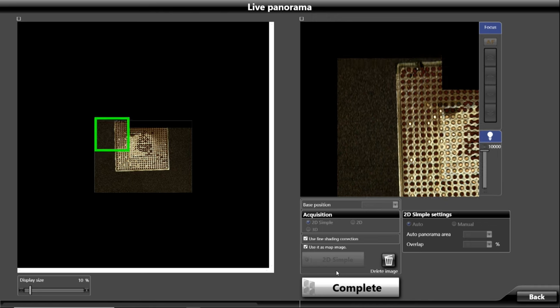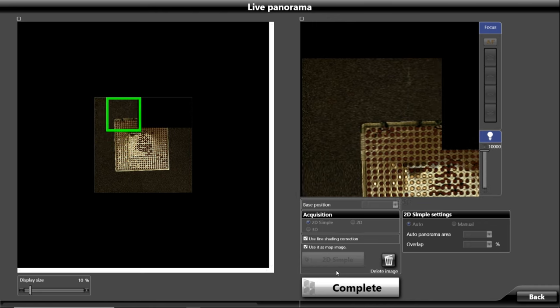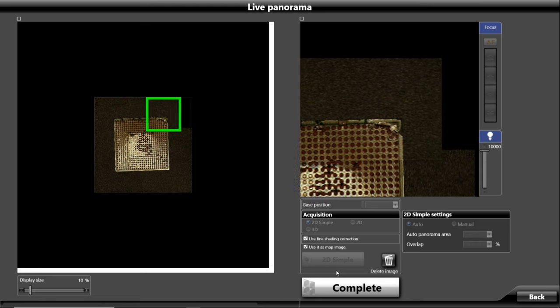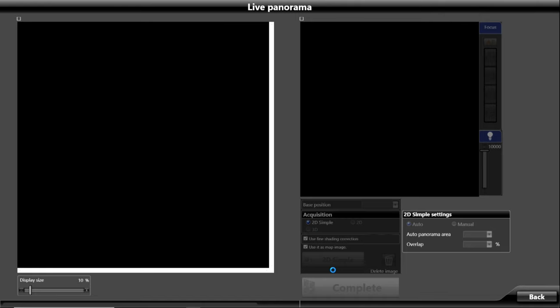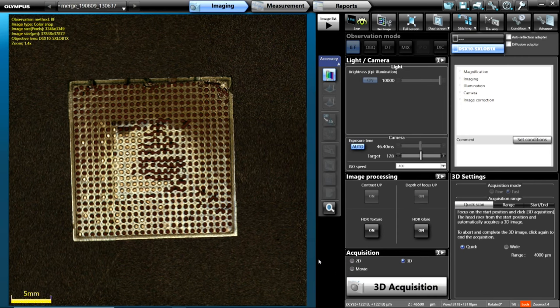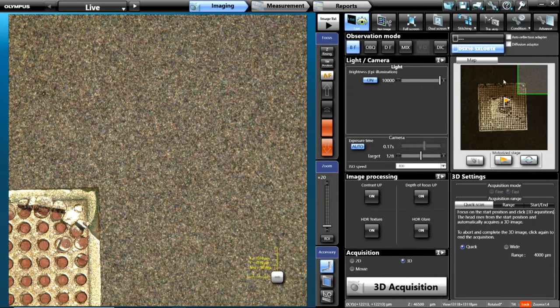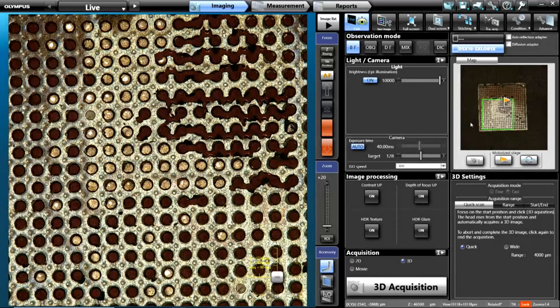All I had to do was tell it that I wanted to do a 3x3 — 3 fields of view by 3 fields of view — that I knew would cover the area. When it's done, we'll not only get a stitched image that we could save out, but we can go back to our live observation and it uses that image as the map image over here. This makes it convenient to quickly move around your part to certain areas of interest, and it keeps an update of your location on the part.